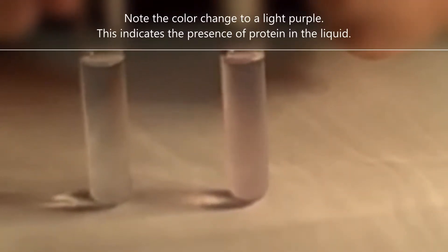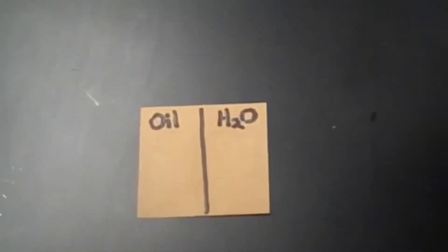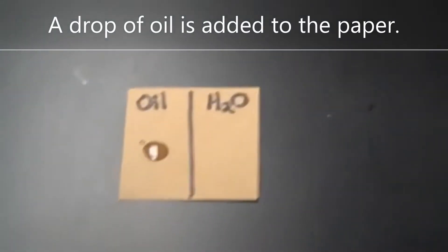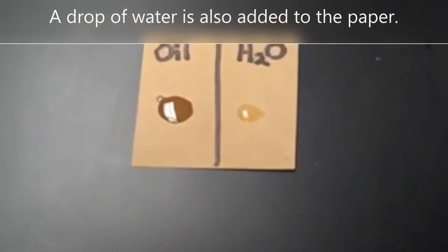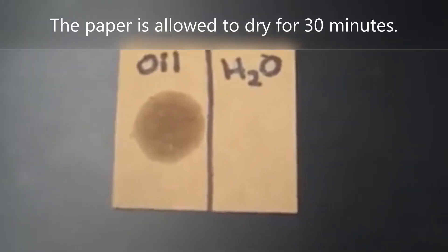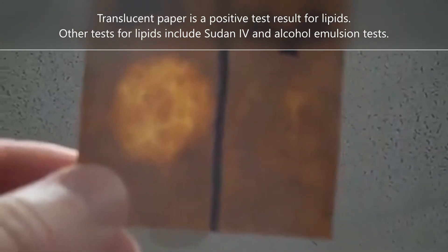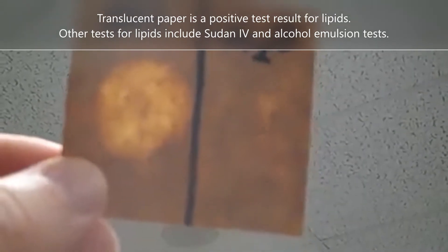It's blue. Lipid test. Brown paper. Drop of oil. Drop of water. Brown paper test after 30 minutes. Note the translucent paper — positive test for lipid. Note the opaque paper — negative test, no lipid in water.